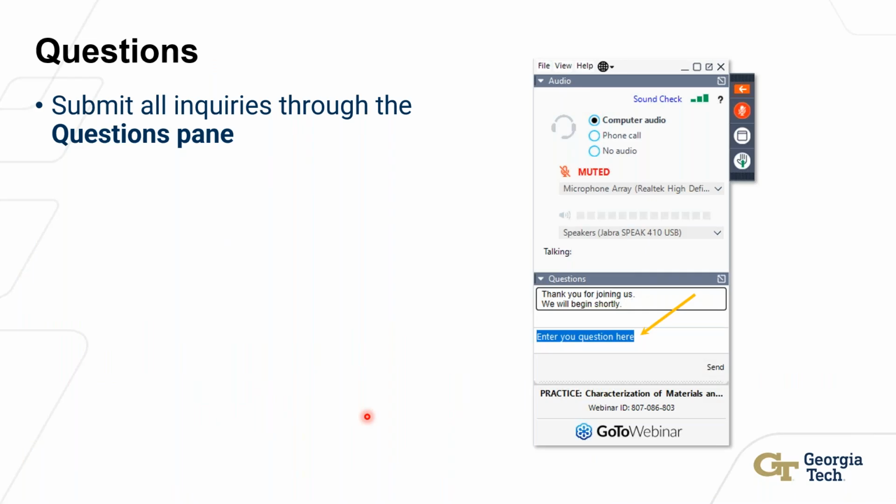Sure. So the indexing success rate, whenever you're conducting these orientation maps, you always have a reliability index associated with the template matching. And the reliability index is essentially a measure of how well the template matches the patterns.